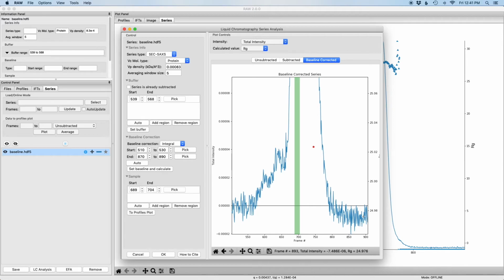The reason that this is actually down is that the integral baseline correction can overcorrect. It can't apply a negative correction, so it assumes that all the Q values must be increasing. For noisy Q values, particularly at higher Q, this isn't always the case, and so for those it applies zero correction when really maybe it wants to apply a negative correction, and you end up overcorrecting the sample by applying just this positive correction.